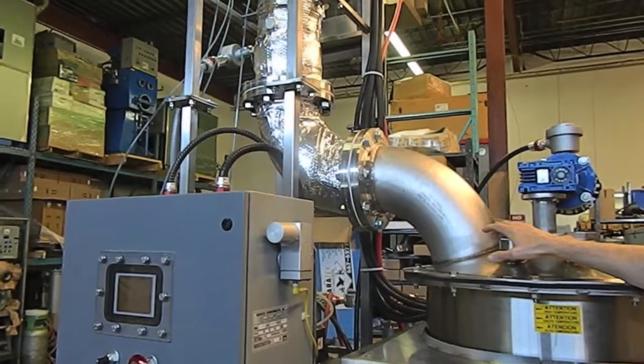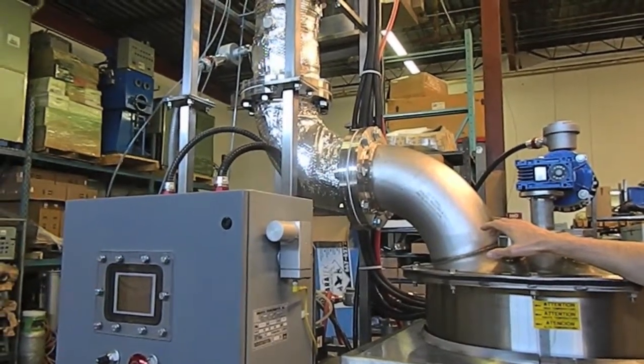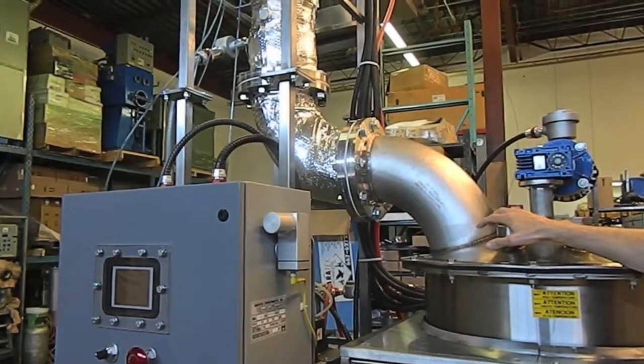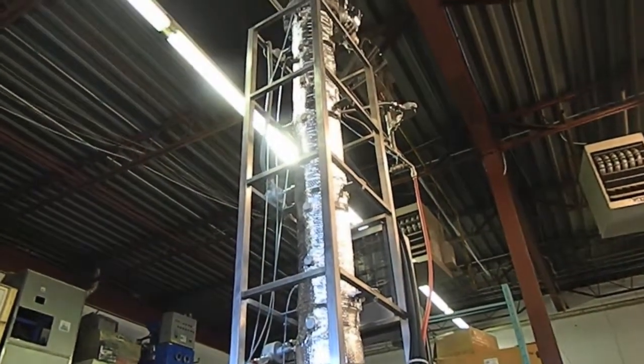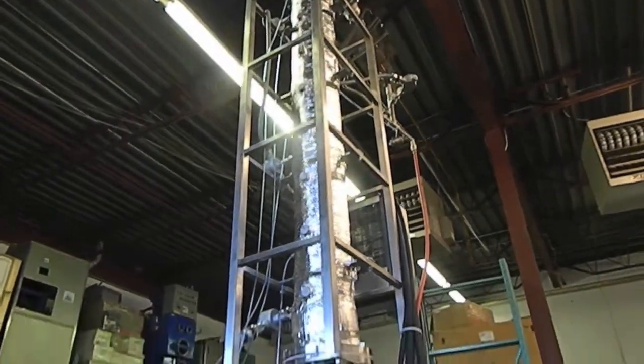We have a team of engineers here and we use the latest software — SolidWorks and Aspen Technology chemical engineering software programs — to design these custom distillation units to fit even the most complicated recycling opportunity.